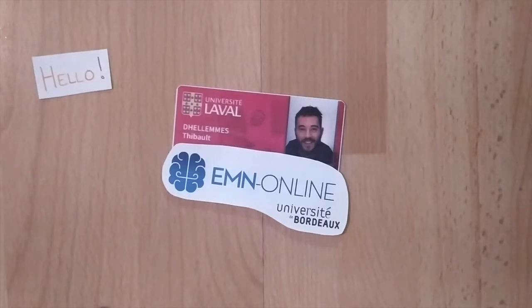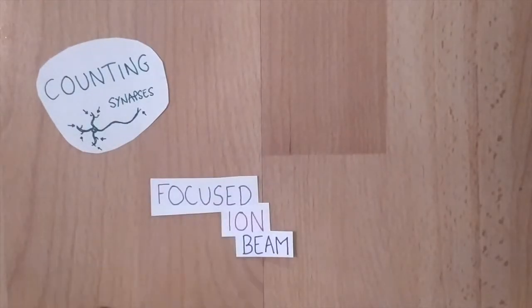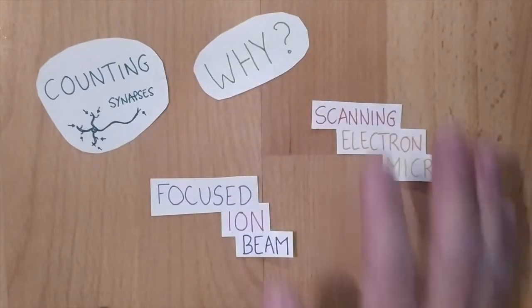In this video, I want to share with you my work in Quebec by introducing you to SEM, an electron microscopy technique. So, I will talk about the work of Perez's team on counting synapses using focused ion beam scanning electron microscopy. But before going into details about the technique, let's talk about why they use it.